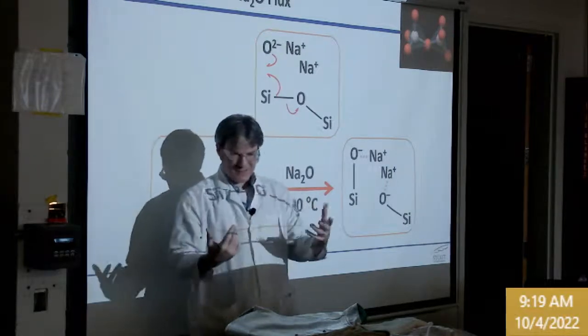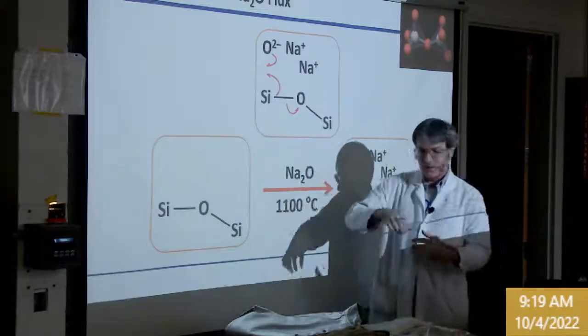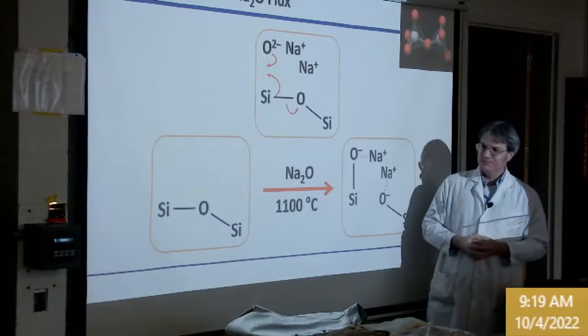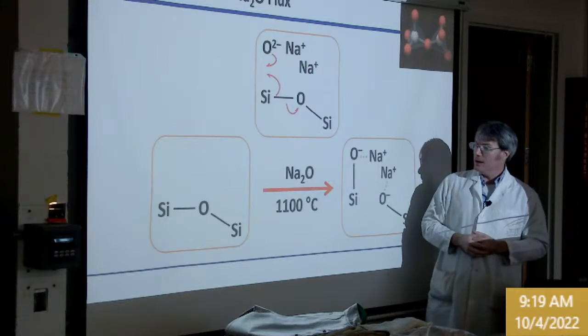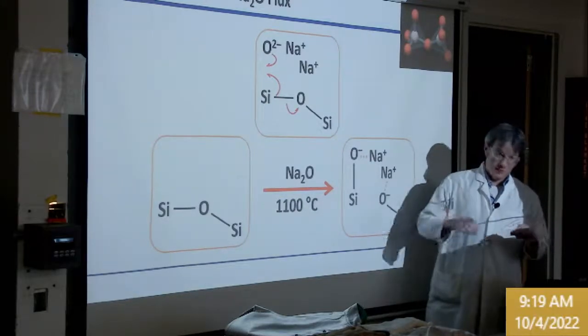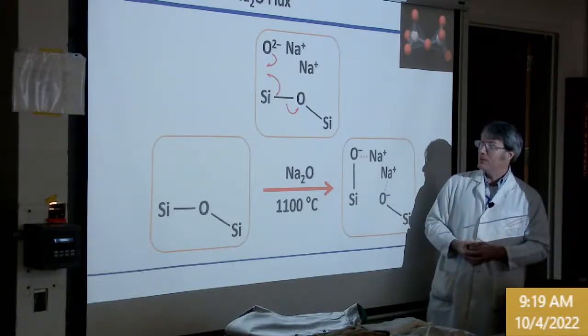So the carbon dioxide bubbles, the crucible actually had a glass bubble forming on top, and then it pops and it's kind of like boiling potatoes, you know, all that kind of foam you get on top that sort of builds up. It's kind of like that. Or enter your favorite cook boiling over story. But the idea is to keep enough space in the crucible to prevent it from actually boiling over, because that makes quite a mess in the furnace because it's glass after all.